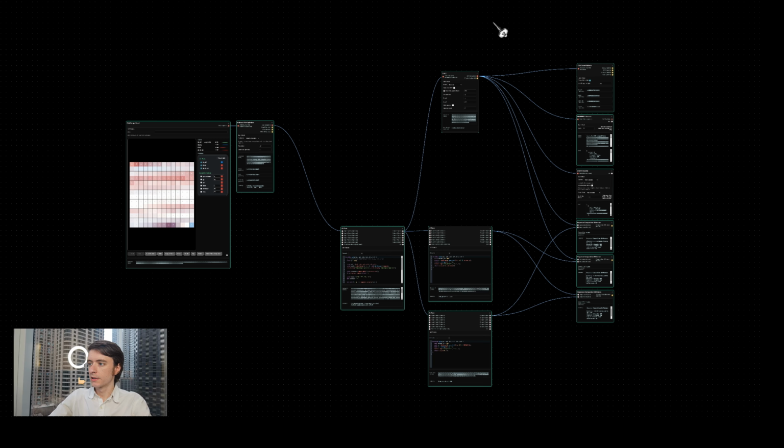Step two here is going to be within this rectangle right here. That is going to be where we are engaging Evo 2. We're feeding the DNA into the Evo 2 model, and it's going to tidy it up for us. It's going to make it look organic so that it has a higher chance of success in the wet lab in the final days of the competition, 47 days from now.